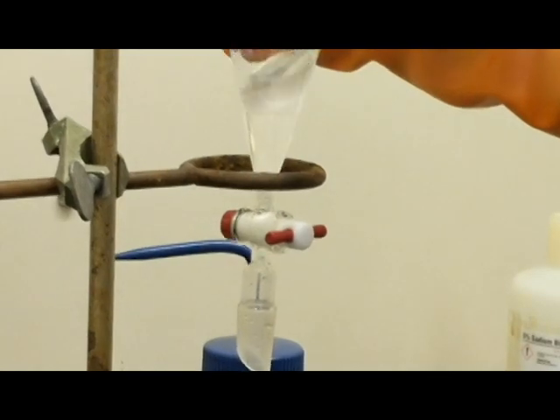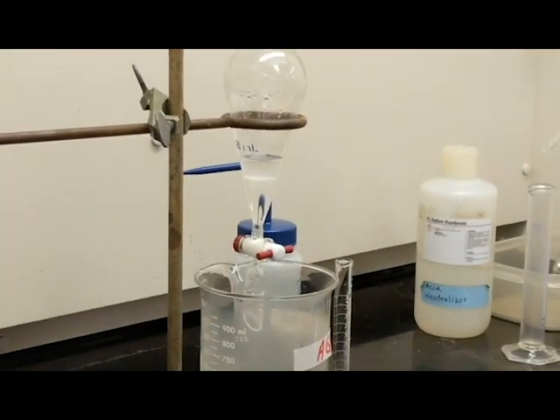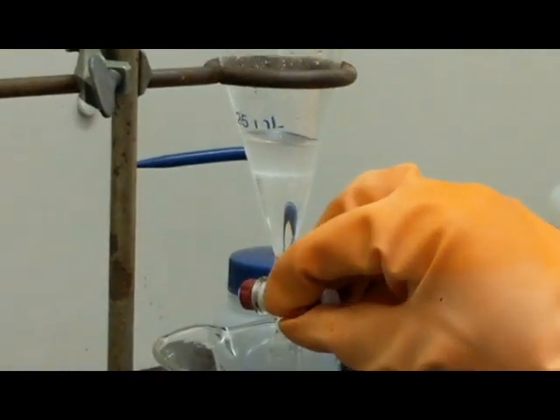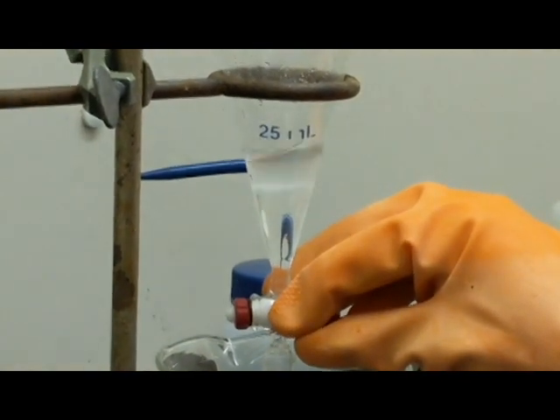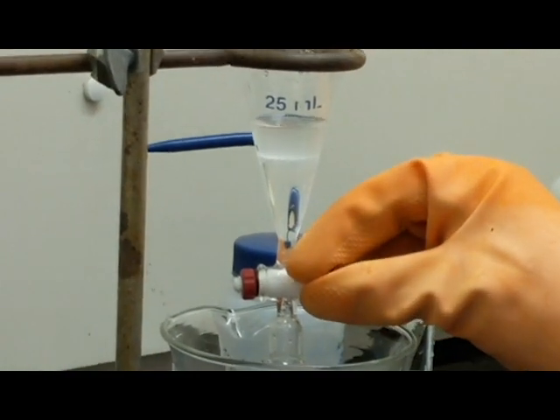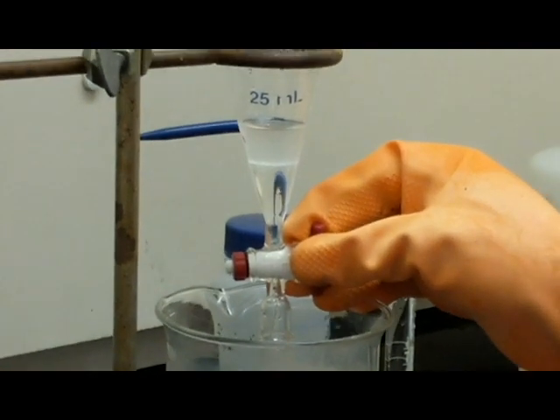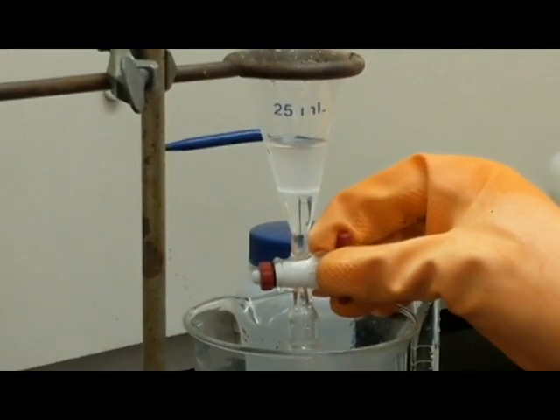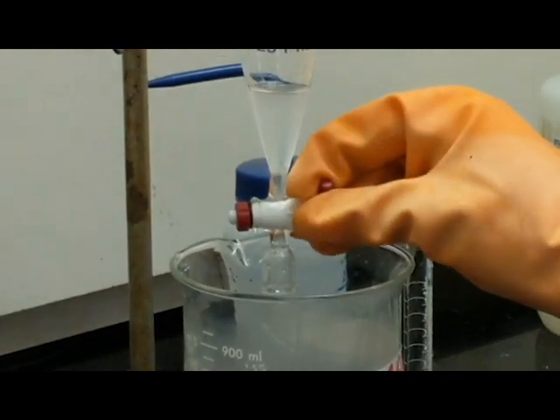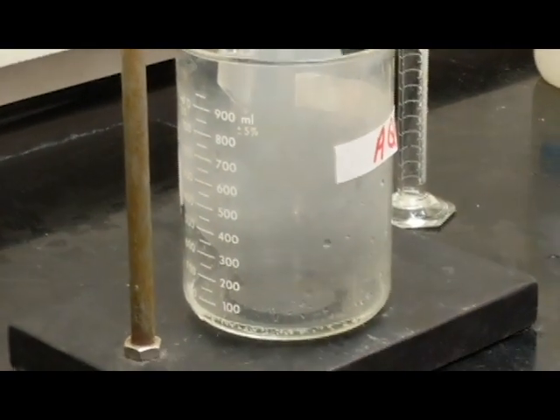We want to remove as much of the aqueous layer as we can, because at the very end, we're going to use a drying agent to remove all the residual water that's still inside the system. So it's better to lose just a little bit of the organic layer rather than keep too much aqueous layer in your final product. At this point, you'll see some bubbling occurring in the aqueous layer. That is the sodium bicarbonate now neutralizing the highly acidic aqueous wash.